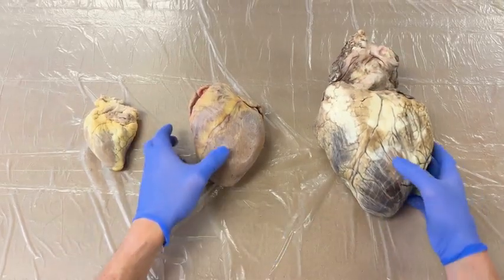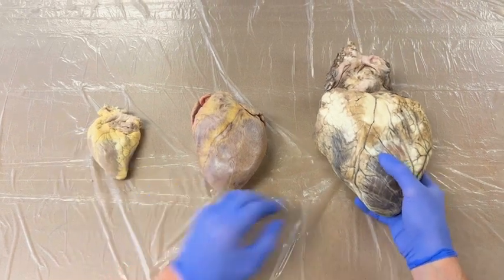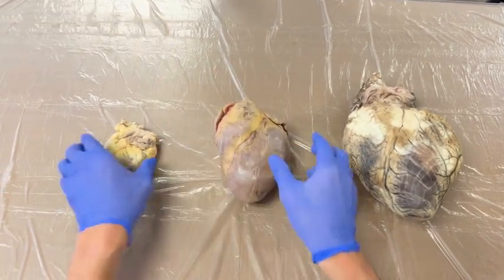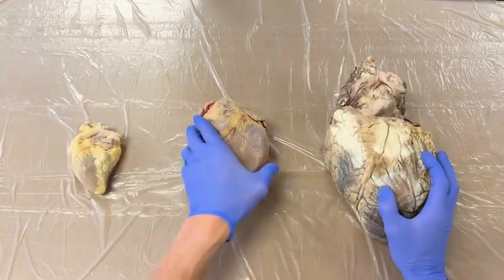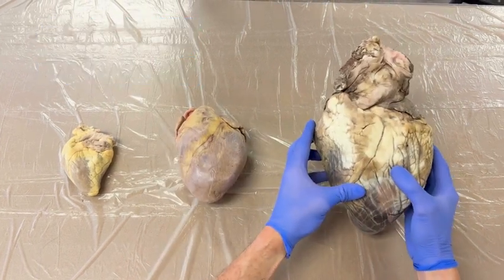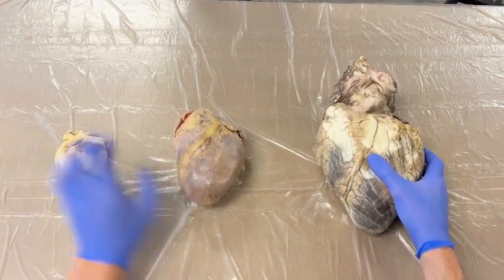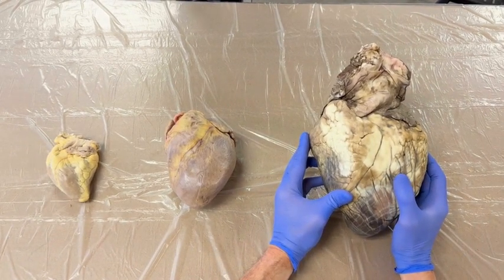Okay, let's start by looking at the three different heart specimens. So this is a cow heart, this is the pig heart, and this is the sheep heart. The most striking difference is the size. You can see that the cow heart is actually huge relative to the other mammalian hearts. And the reason is that the heart size scales with how big the animal is.